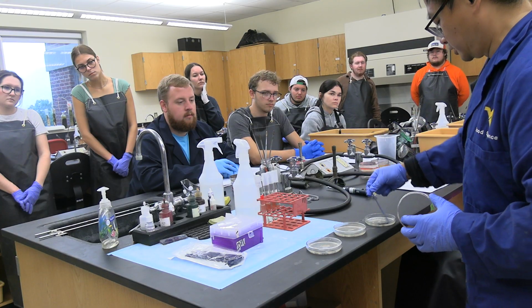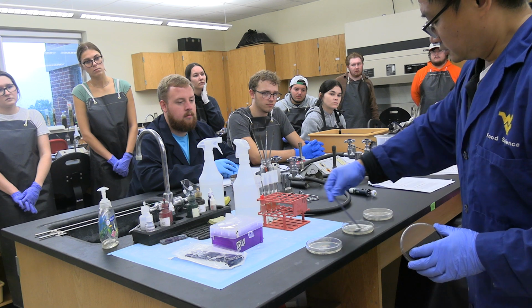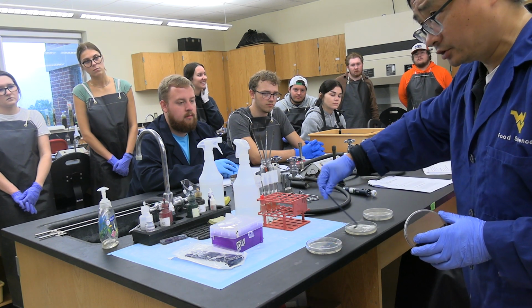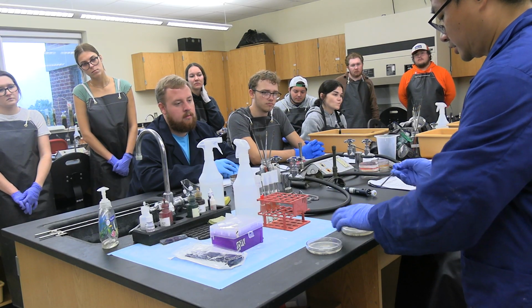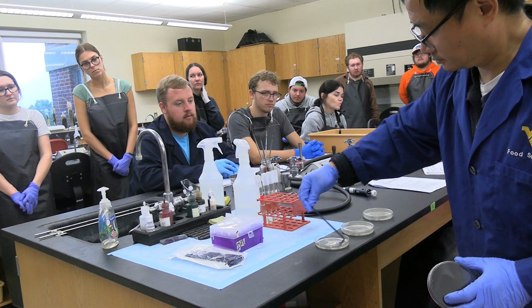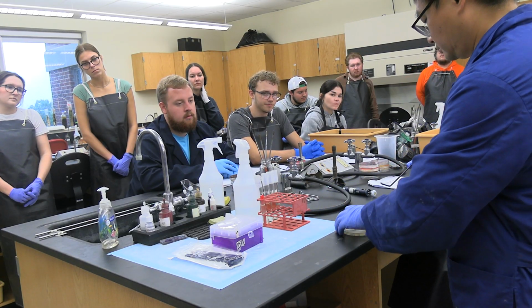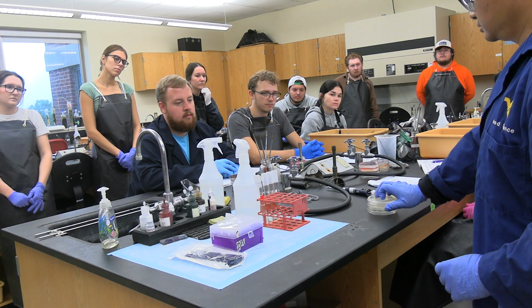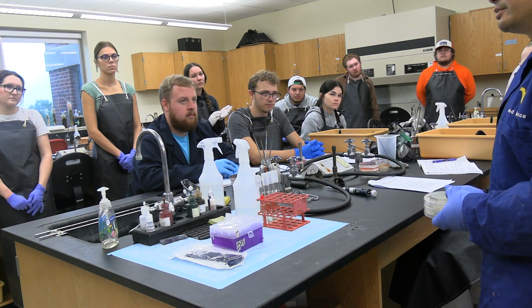We've done this a lot in the lab, maybe 20 years. Second one, this is what I said. You can use one spreader because when you carry on from the 10 to the power of 7 dilution, it's a very limited amount. Okay, the last one goes here. Dry a little bit, flip it over, because of the condensation, we don't want the moisture to damage it.